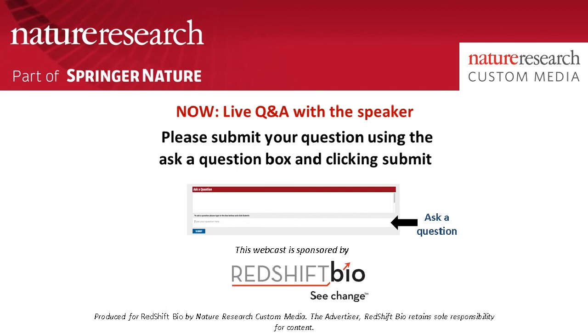We don't see ThT binding to alpha sheet. The ThT binding comes in at the beta sheet when the beta sheet is formed, and so there may be some low affinity binding, but we have no evidence for that, and we have looked quite hard. So we see the alpha sheet come in and form before the beta sheet, and we can see the trade-off between them. As the alpha sheet comes in during the lag period, we also pick it up in the CD, and we pick it up in the NMR under the same conditions as the ThT assay is performed. And there is no binding of the ThT to the alpha sheet species. I see. Thank you very much.